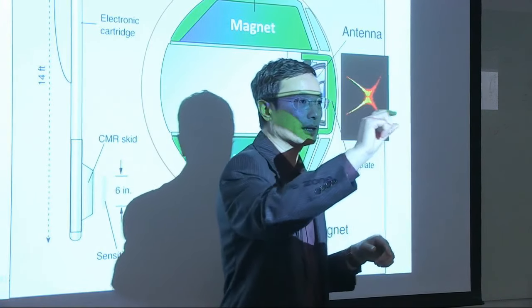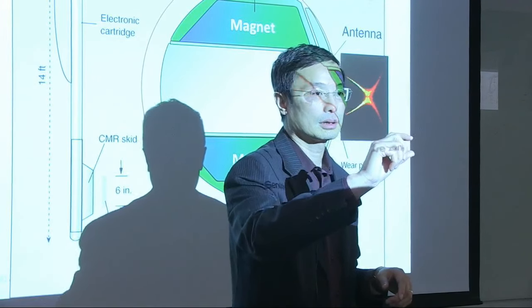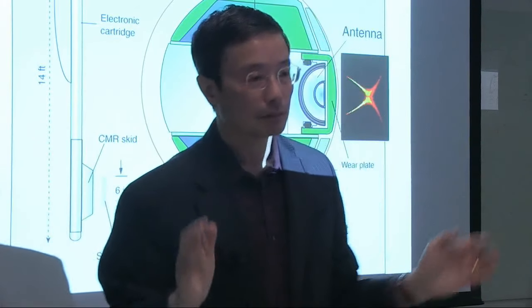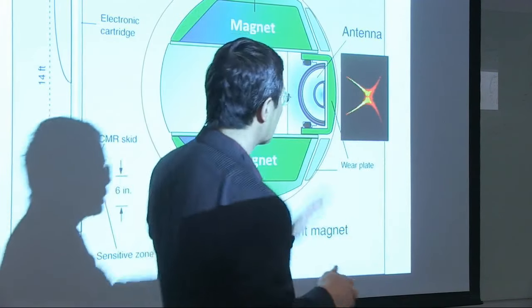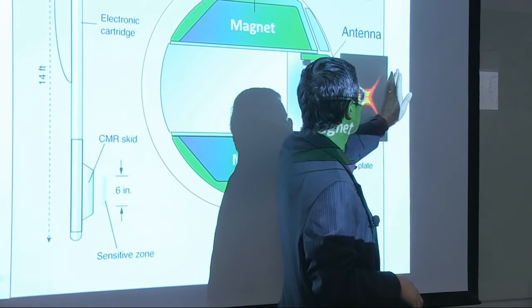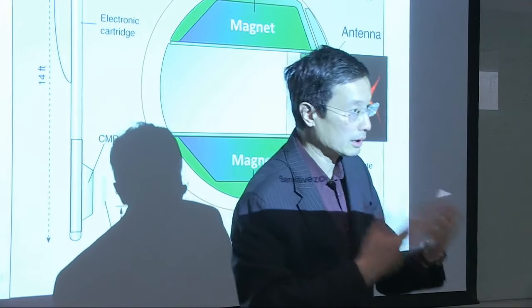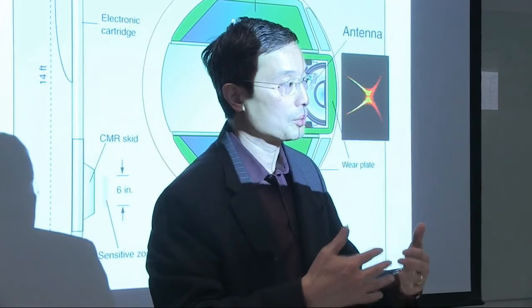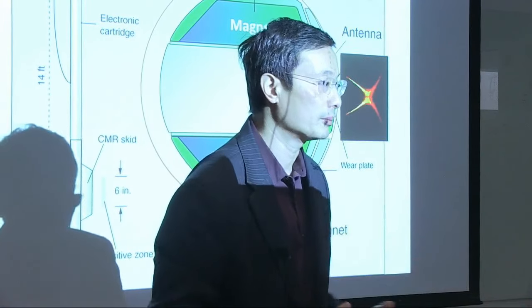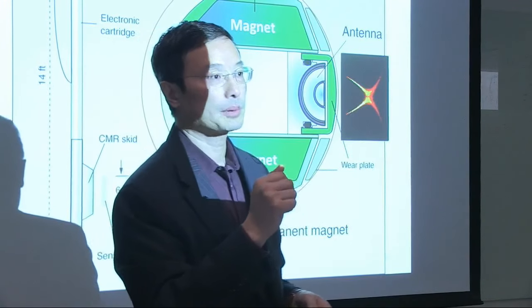There's a little bit of a bandwidth that we can specify, but that's only a few Gauss. If you say, I want to go to 1 megahertz, then you have to be farther away. So 1 megahertz is probably here. By changing the frequency of your instrument, you change where your sweet spot is, or how far you are from your instrument.